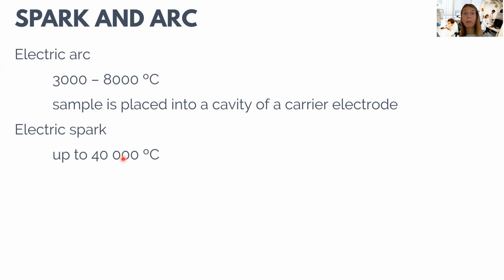However, for qualitative analysis, it's still possible, and electric spark can be very informative in trying to find very low concentration elements and just detecting them.